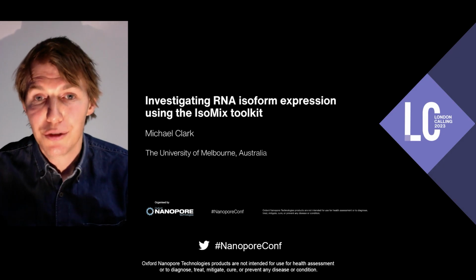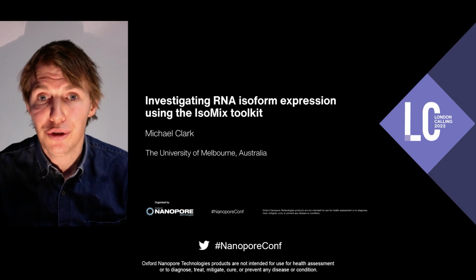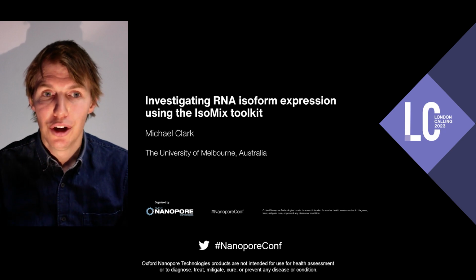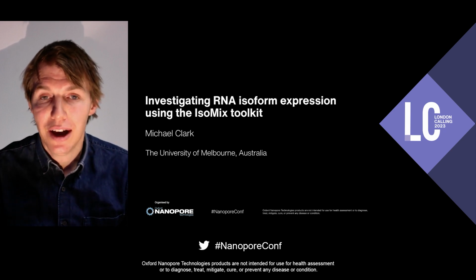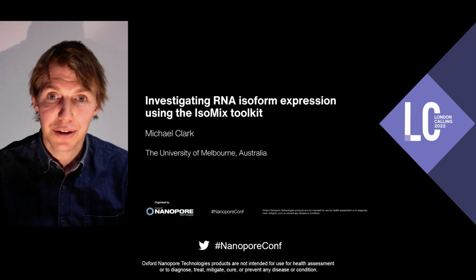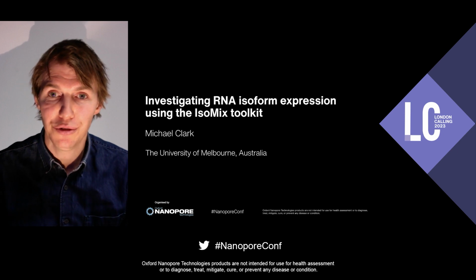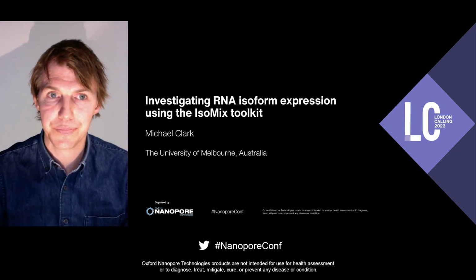I'm Mike Clark from the University of Melbourne, and I'm going to talk a bit about some of the software tools that we have created to allow us to analyze RNA isoform expression using nanopore sequencing, and hope that perhaps some of these tools from the IsoMix toolkit might be useful for your lab as well.